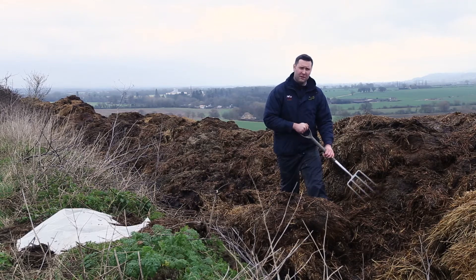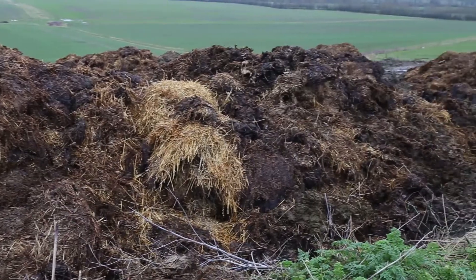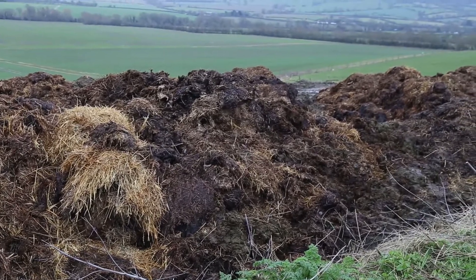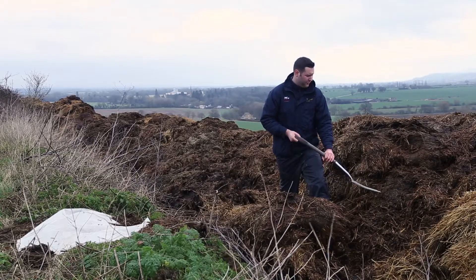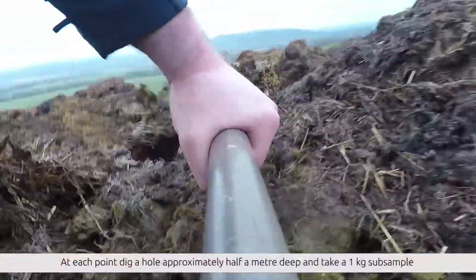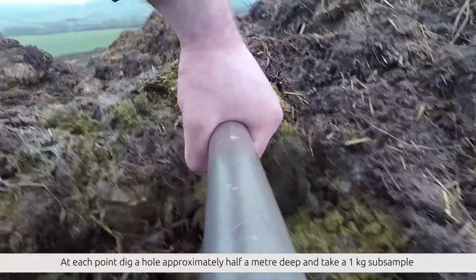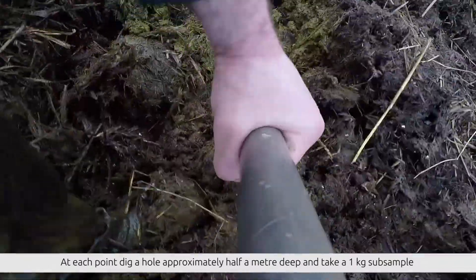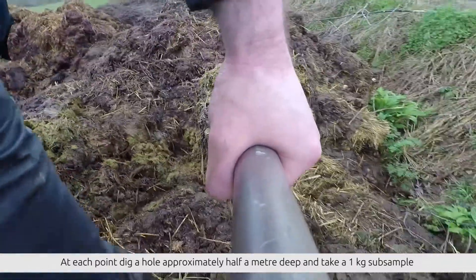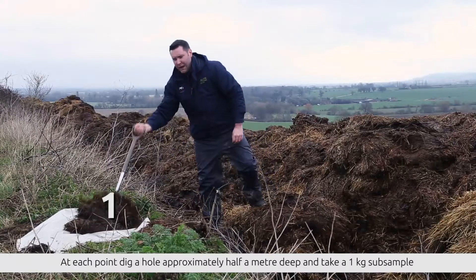In order to find out what the nutritive value of this is, we have to take a representative sample from ten different locations within the heap itself. To start off I will take a sample from this, making sure to get it onto the plastic sheeting.